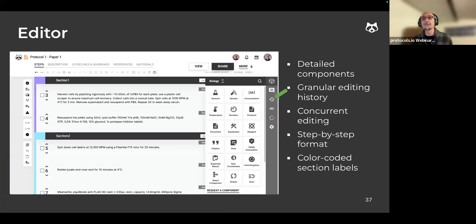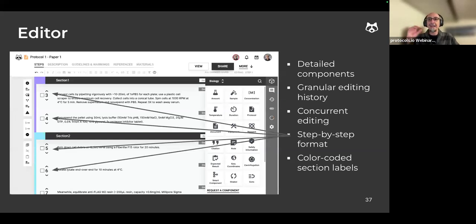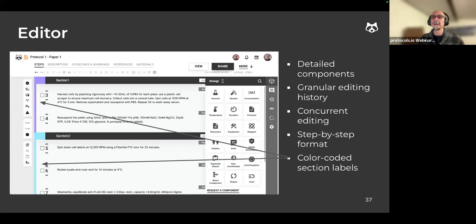The editor also allows concurrent editing by 2 or more collaborators, the same way that 2 or more people can work simultaneously on a Google document. The protocol itself is written in a step-by-step format, and different sections of the protocol can be coded in different colors, as I showed you before.